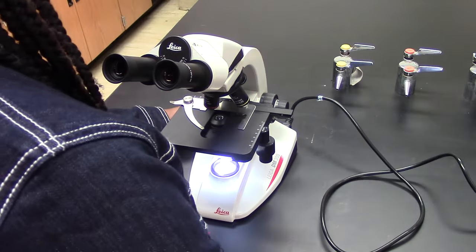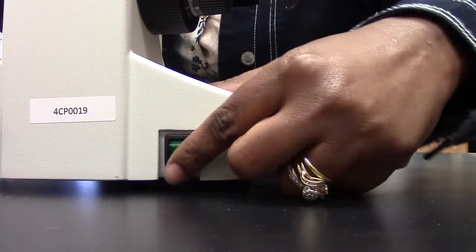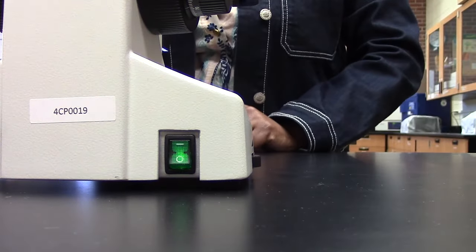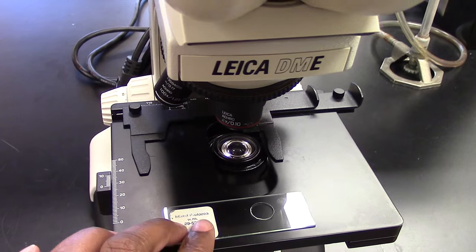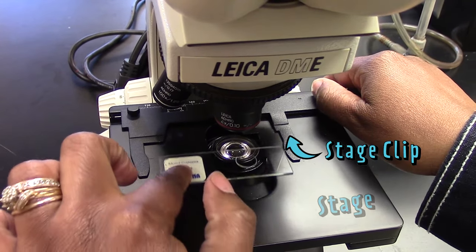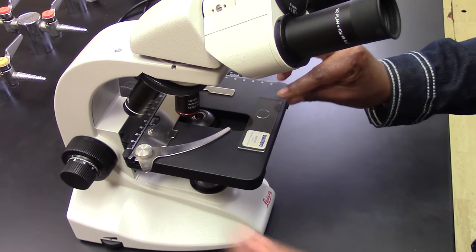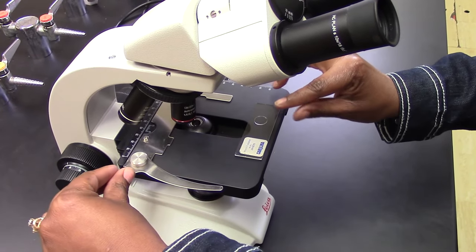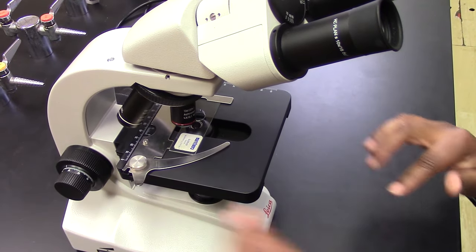The microscope has a light in it, so you have to plug it in and turn it on before you'll be able to see anything. When you put the slide on the stage, open the stage clip to fit the slide onto the stage. If your stage clip swings open like this, it doesn't sit on top of the slide — it uses pressure to hold it in.